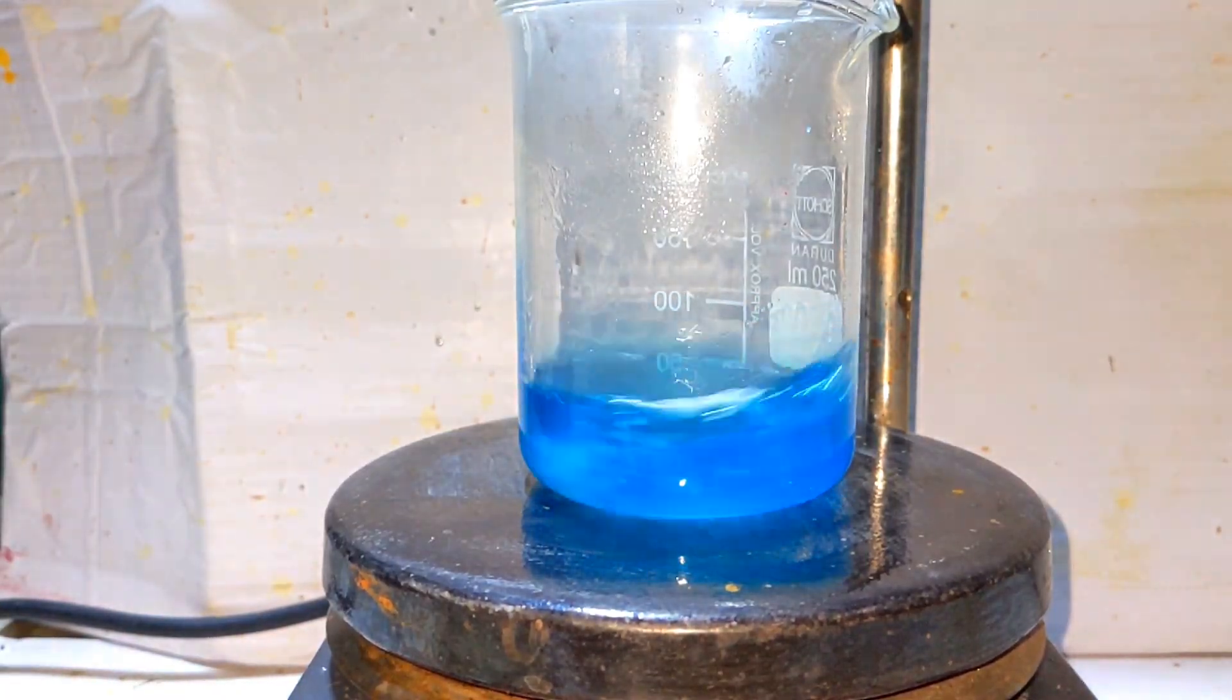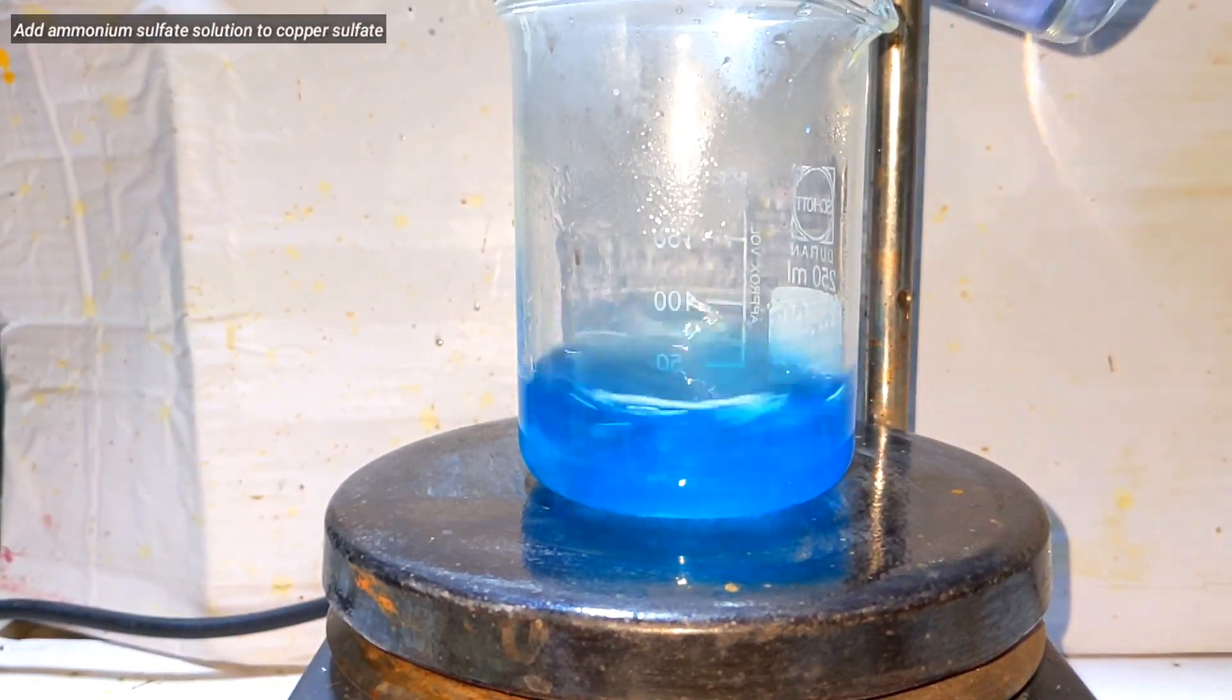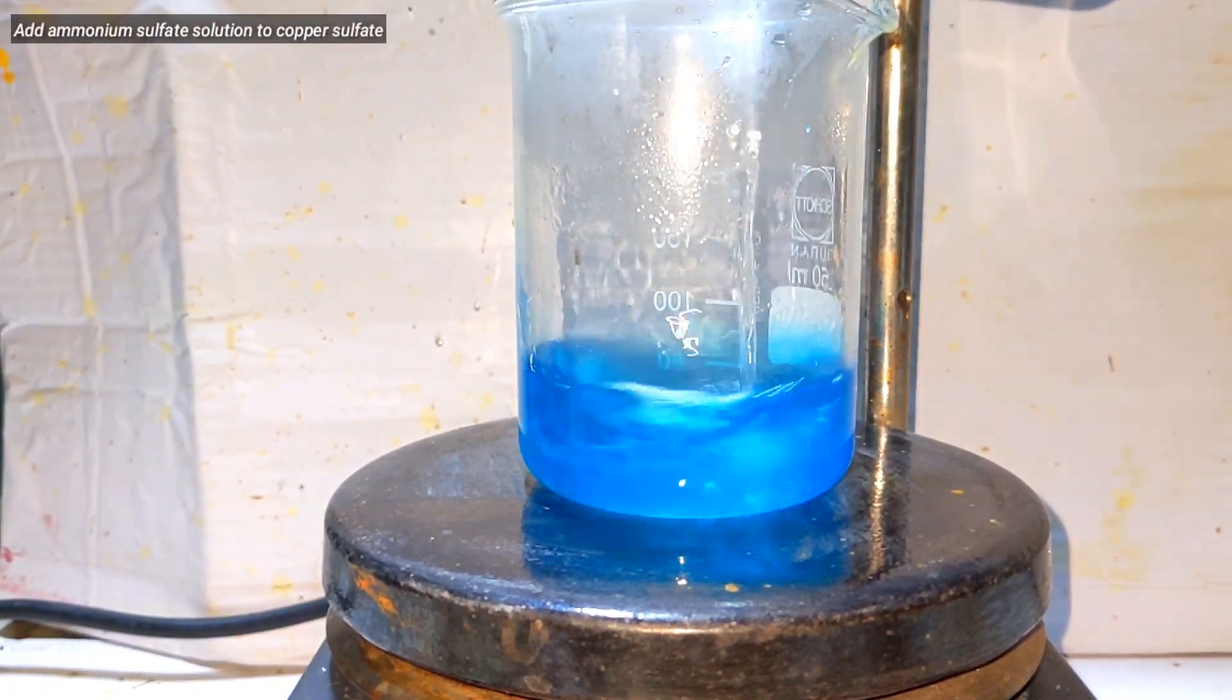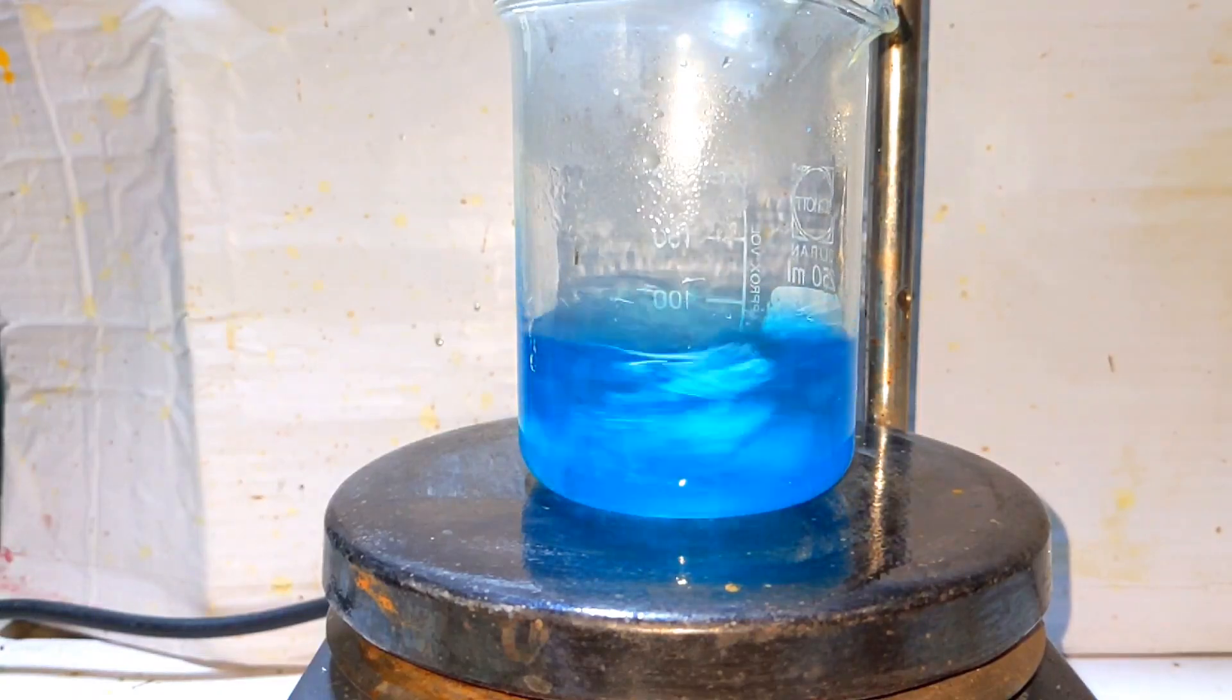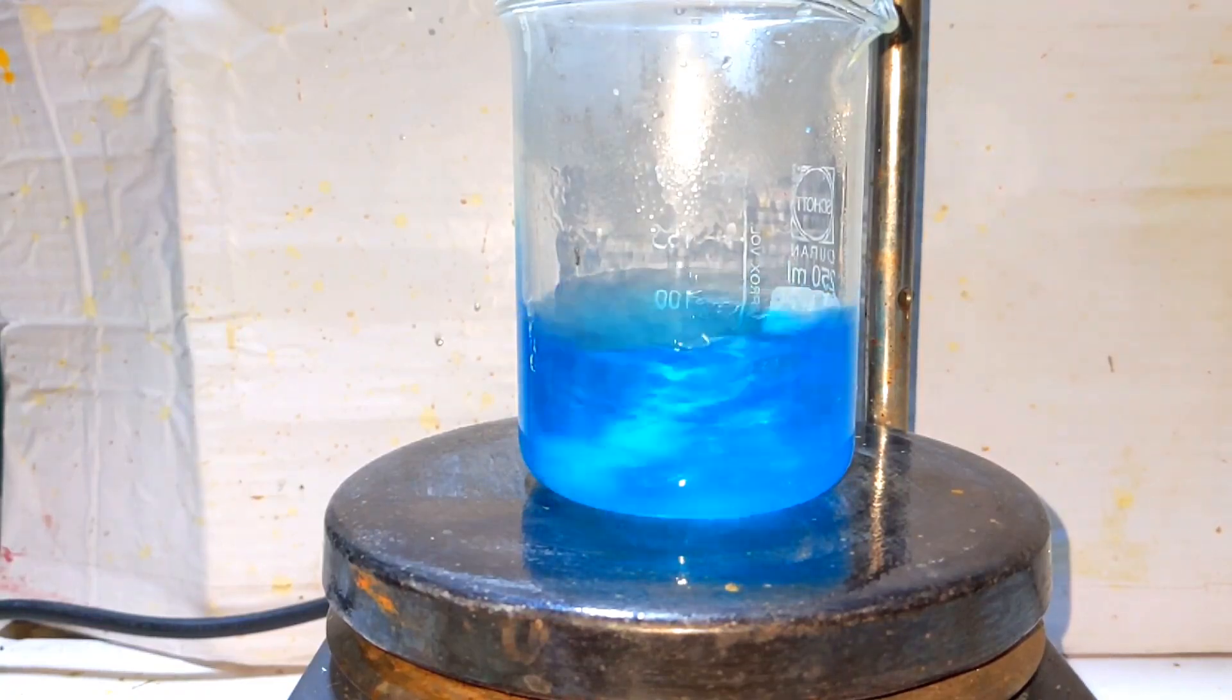The copper 2 sulfate solution was then placed on a hot plate and was heated. The ammonium sulfate solution was then added to the copper sulfate. The resultant solution was boiled for two to three minutes. This results in the formation of the double salt.